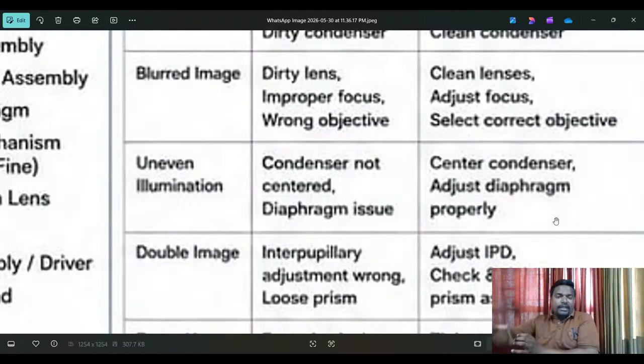Next, you are seeing one way, then how is it possible? Because of students, many problems will come, and they don't know, so we have to check it and give the guidance. Because the complete responsibility for the medical equipment is ours, that is the reason we have to give guidance, give service, and provide proper experience and knowledge to the team. Then only we can provide the services within a short time. Okay, I hope you got it, friends.